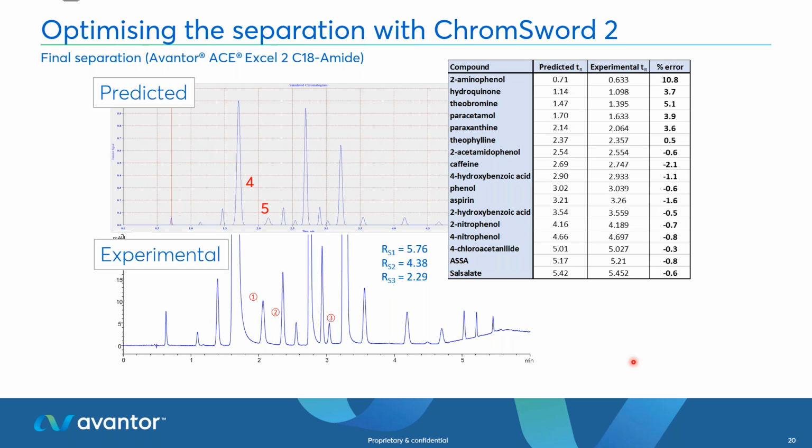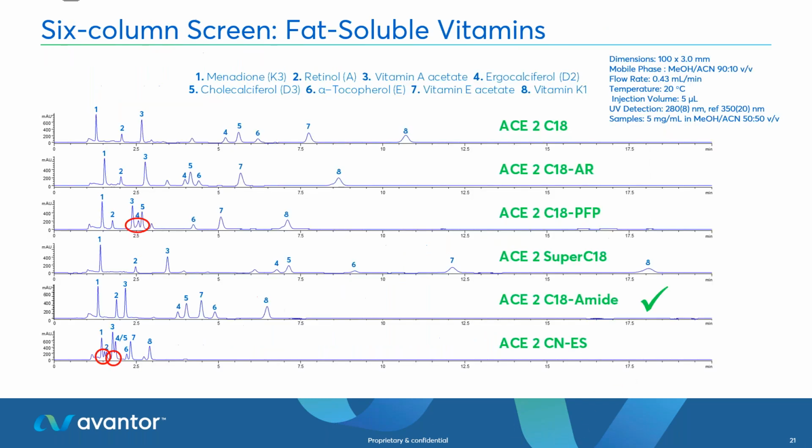So we managed to get baseline resolution above 2 for all of the critical peak pairs by utilizing that software.